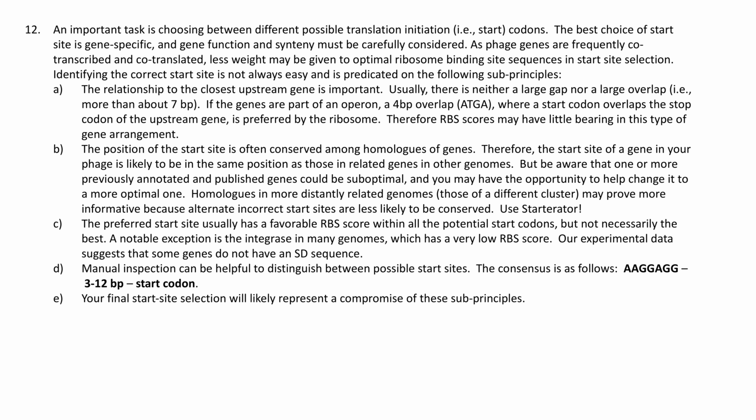Another thing to keep in mind is that starts for genes are usually conserved in other versions of that gene in other genomes. And so we call those other versions of that gene homologs. So what we look for is to see whether or not genes have the same start, and then did other people call the same start.